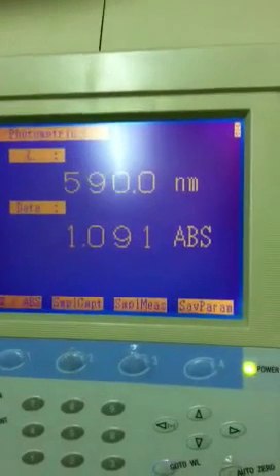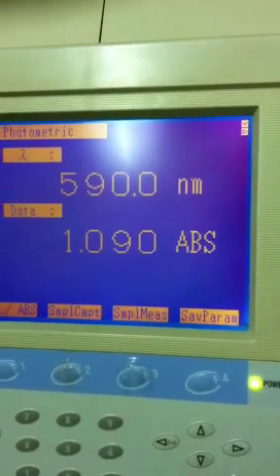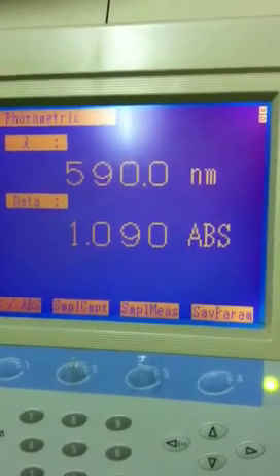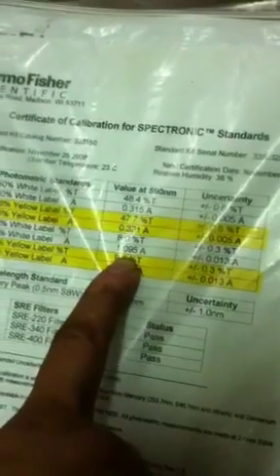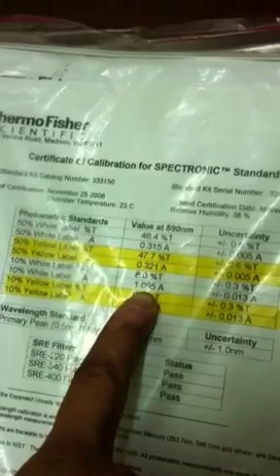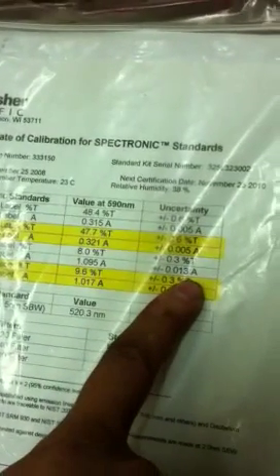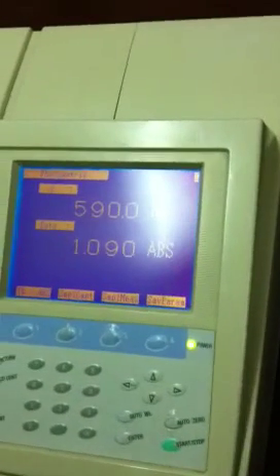This is a 10% 590 nm white. Now you can see the reading is 1.090 and a 10% white label reading is 1.095 plus minus 0.013 absorbance so that's well within range.